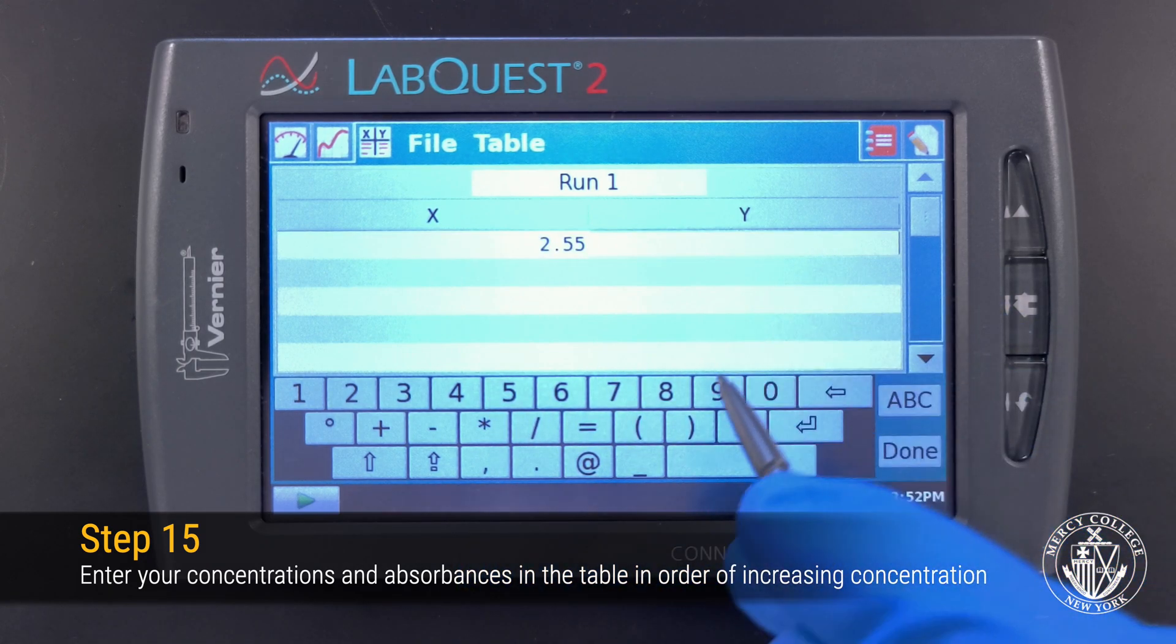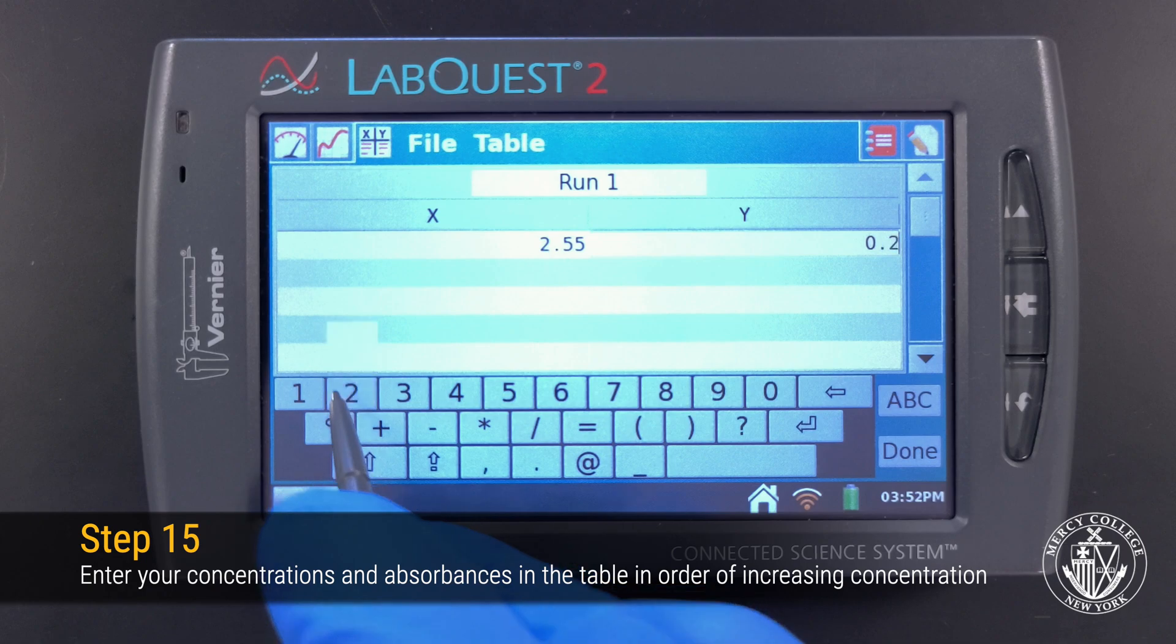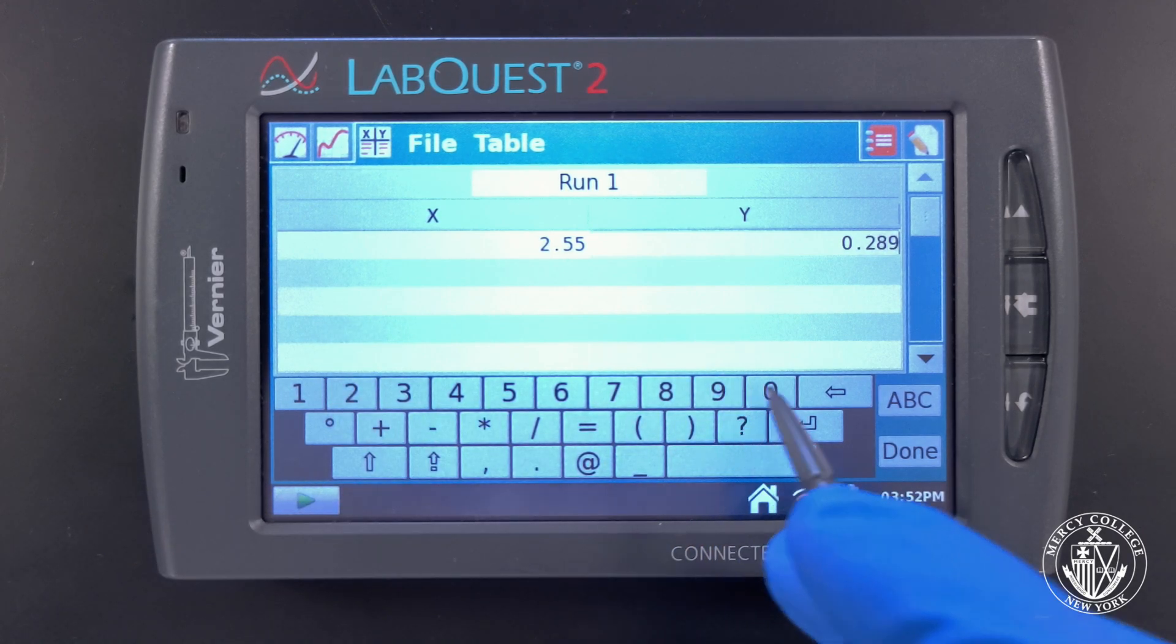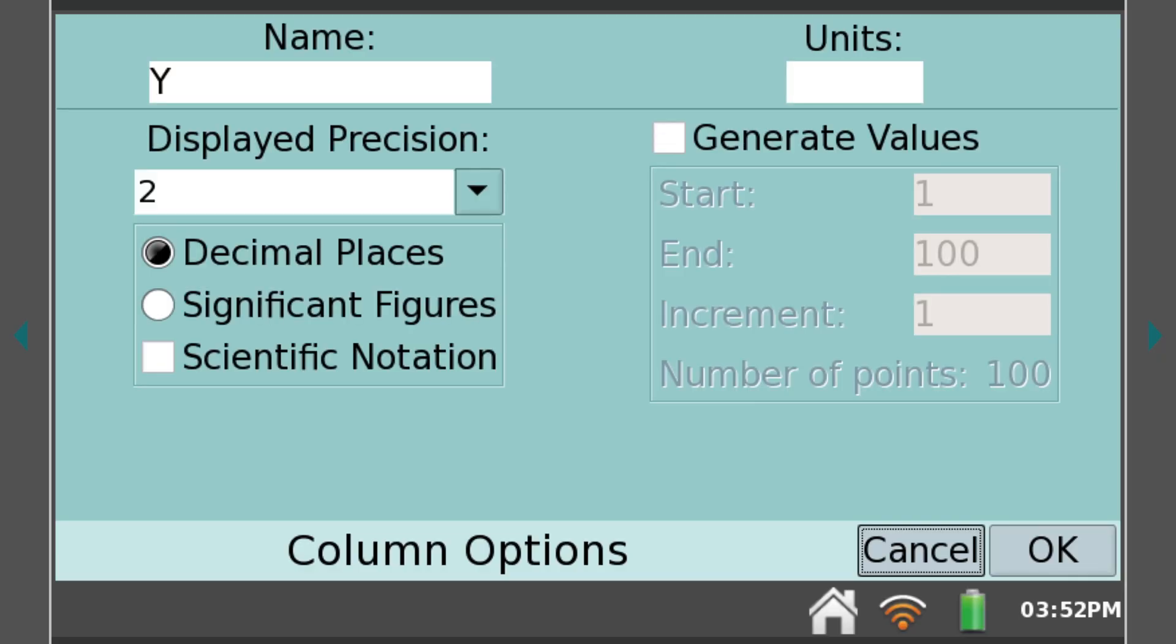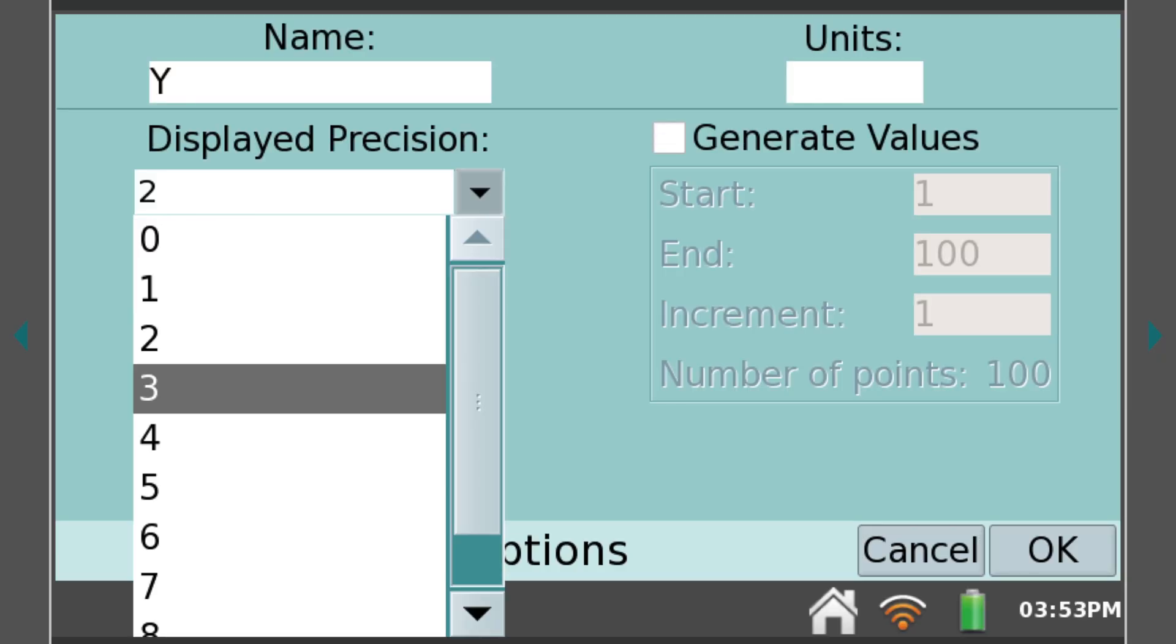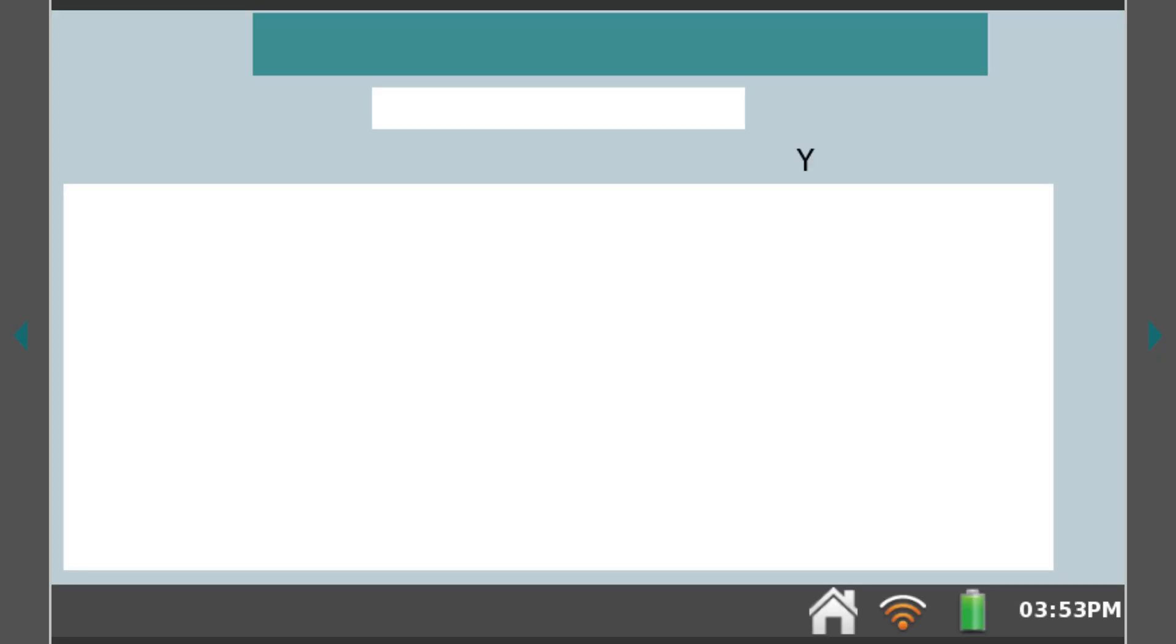If the LabQuest doesn't display all of the digits that you type, you can tap the column header to change the number of digits displayed. Under Displayed Precision, select the number of digits you would like displayed and click OK.